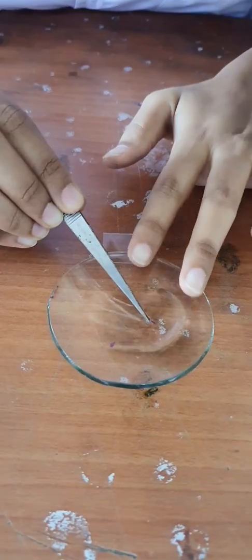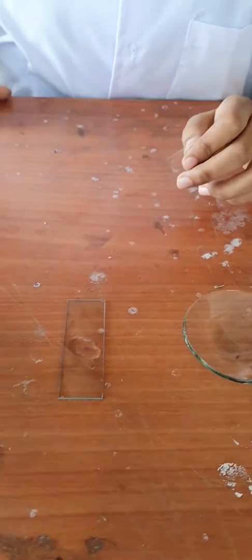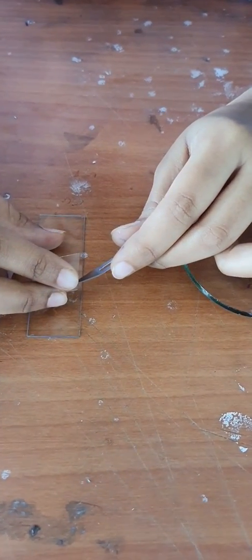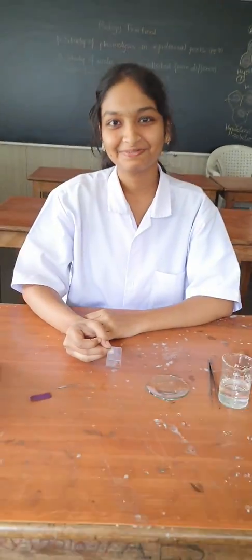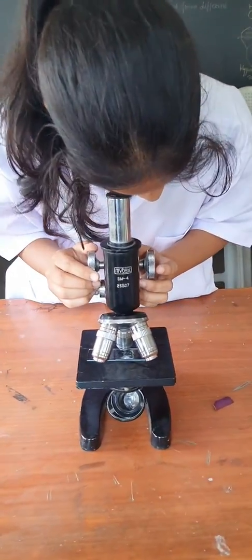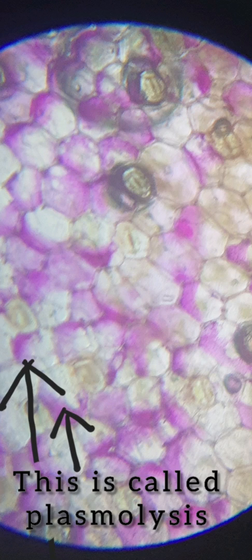After this, take out the section and keep it over the slide. Put the cover sleeve and observe this section under the compound microscope. Under the compound microscope, you can observe that the slide prepared using hypertonic solution shows shrinkage of cytoplasm, which moves away from the cell wall.